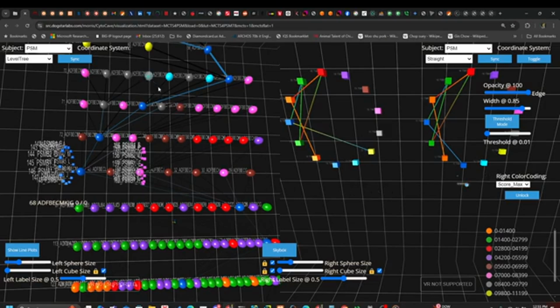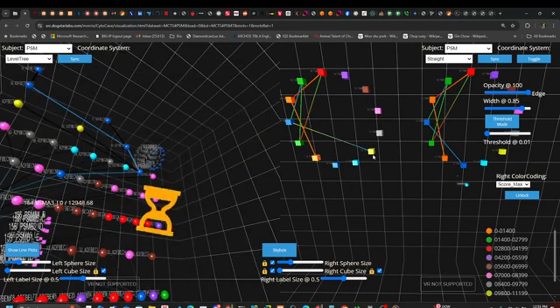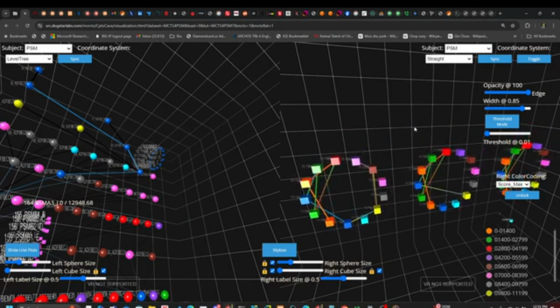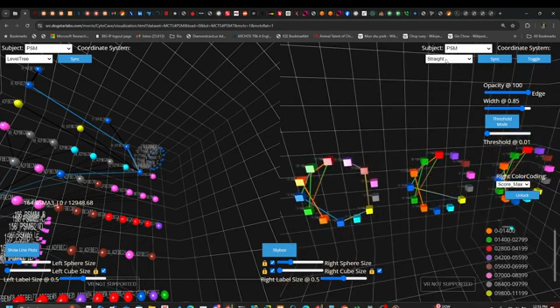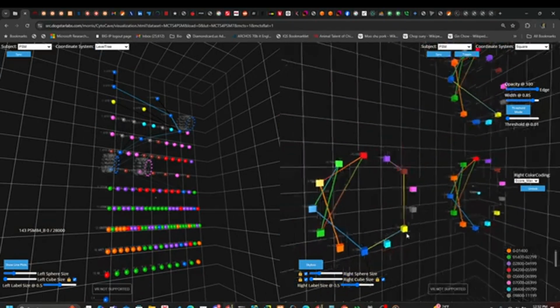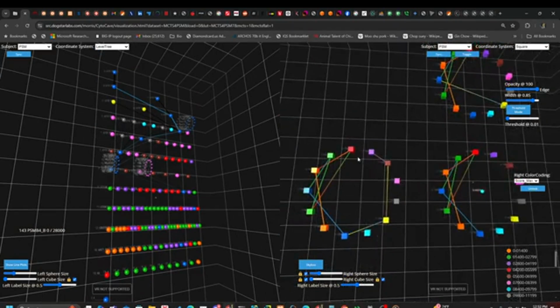You can also include various upstream or downstream states to see the progression of the chain assemblies. They're all displayed side by side. You can use them in a square or in a line, and rearrange them into several different arrangements.